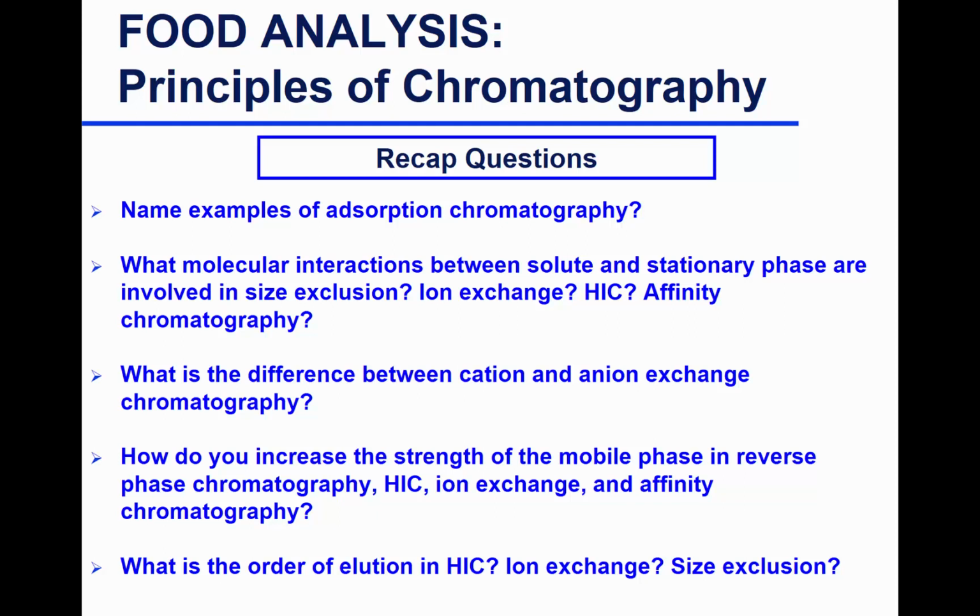What molecular interactions between solute and stationary phase are involved? Forget about size exclusion for a minute. We didn't cover that. Ion exchange, I think I just said it. What interactions? Axel? Electrostatic. HIC? Hydrophobic. Affinity? A cocktail of them. Hydrogen bonding, hydrophobic, ionic or electrostatic, van der Waals, any form of non-covalent interactions can occur in affinity chromatography.